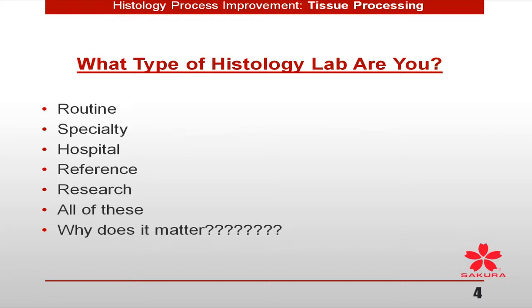Is the use of a conventional instrument, whether it's one of the variety that are out there that you load up at 5 p.m. in the evening and it magically comes off at 3, 4, 5 o'clock or some other time in the morning. That's an accommodation for different reasons, but does that particularly work? Could you take that conventional processor, a microwave processor, a continuous load processor, and then reorganize your workflow and actually affect patient care and turnaround time?